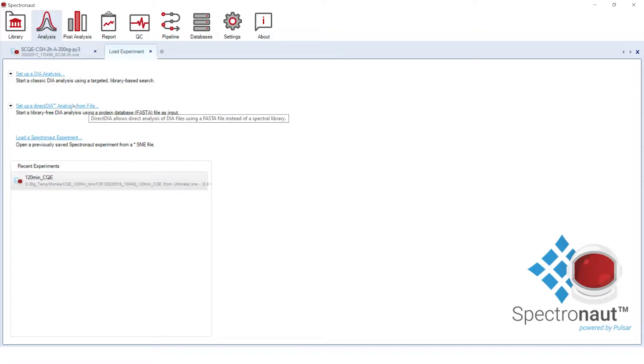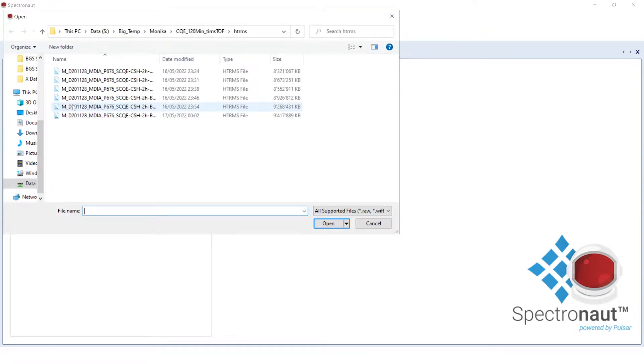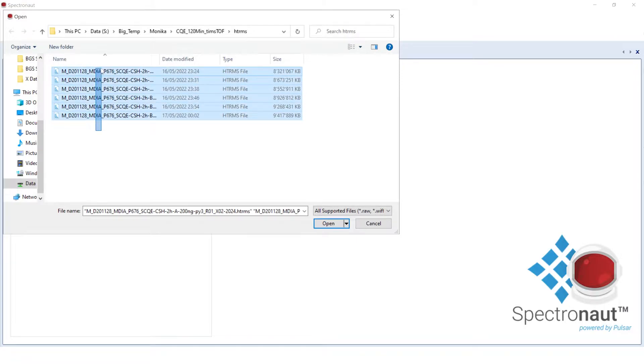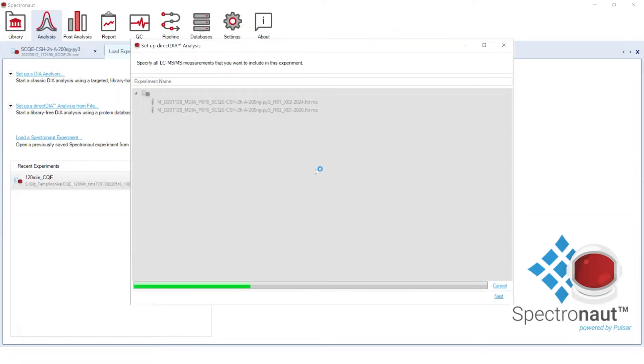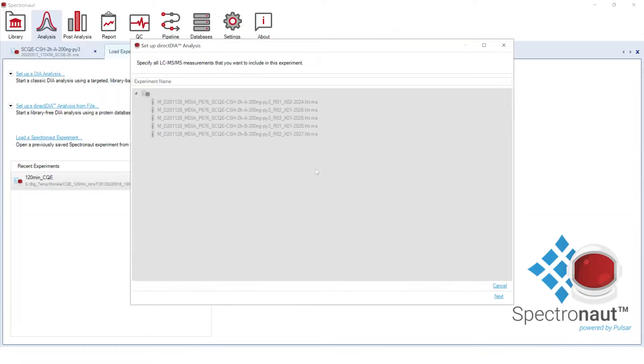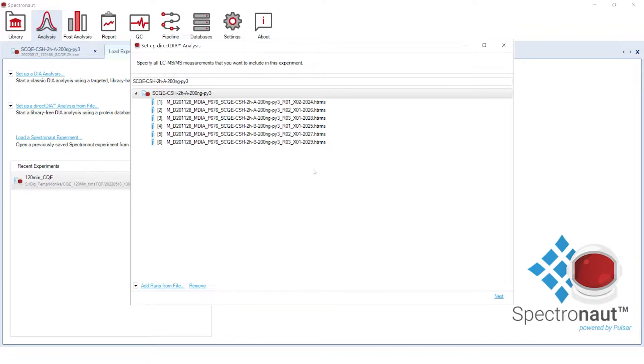To start a Direct DIA workflow, we will select raw MS runs. In this tutorial, we will analyze six DIA samples from four species: Human, E. coli, C. elegans and S. cerevisiae, which were mixed in different proportions in two different experimental conditions. A two-hour chromatographic gradient was applied prior to the acquisition of mass spectra.